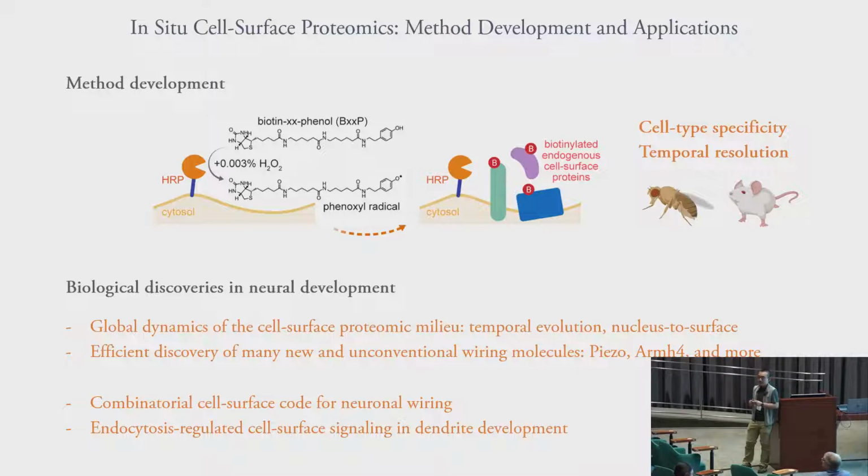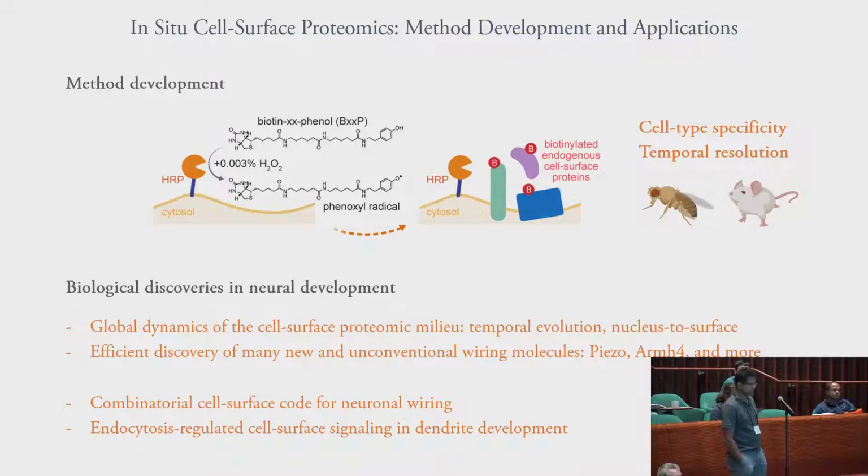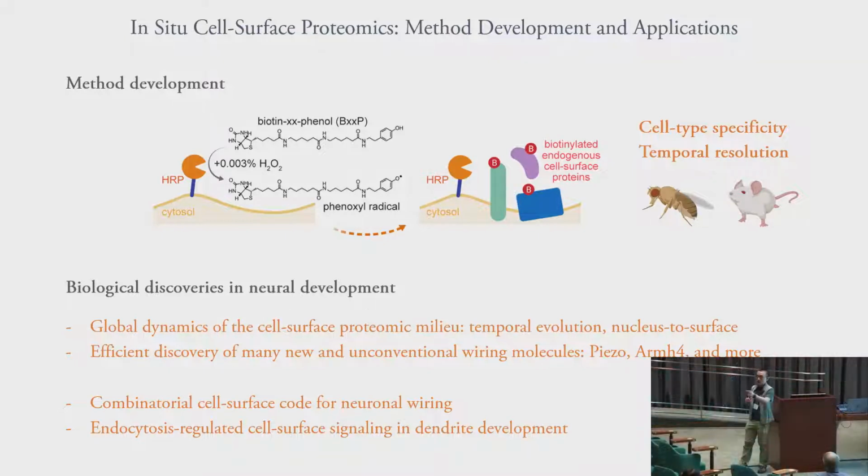But can you give the substrate in vivo to a live mouse, or is that not possible? That's probably pretty challenging because this labeling requires hydrogen peroxide. Although we use it at a low concentration, it's still toxic. And there is a quenching step, which is really important for the specificity. We are now actually working on some new methods to try to push it in vivo. Hopefully, it can be successful.